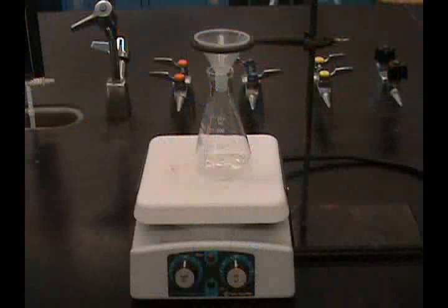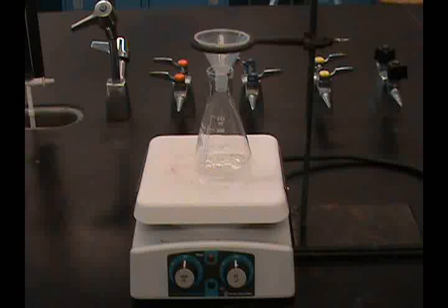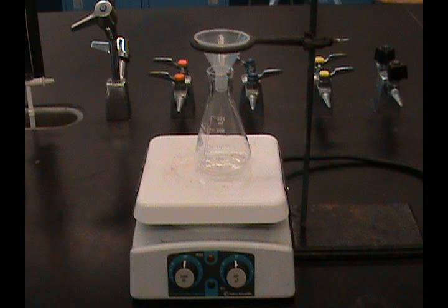Gravity filtration can also be done with hot solvent for crystallization procedures, when the desired product is more soluble in hot solution than in cold and the removal of insoluble impurities is needed.